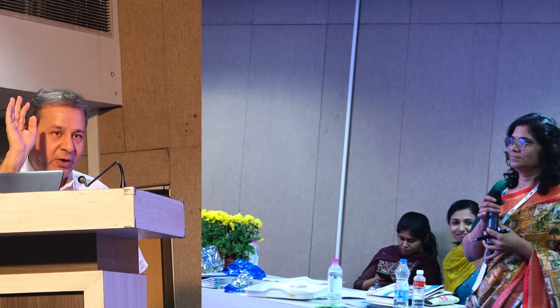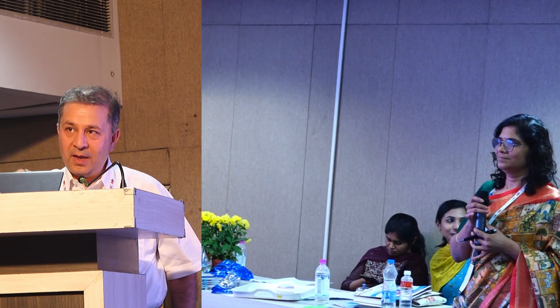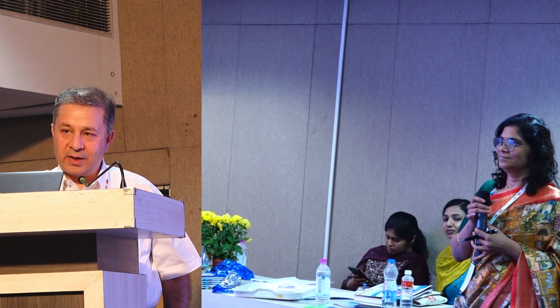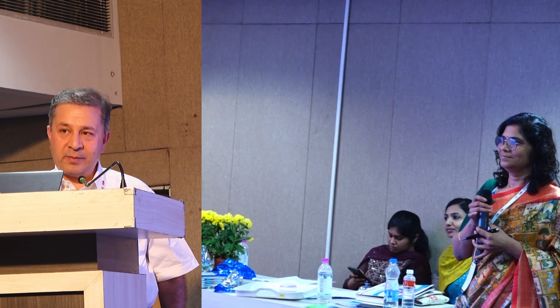And trust me sir, when we do a cadaveric in our center, we do a CDC because if we don't do CDC, it's blasphemy in our country. But I don't bother about it. I only look at my flow cross match results, and I tell my nephrologist, take this guy or take this guy, based on the flow.